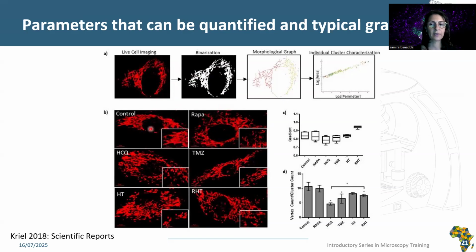And we can have the connectivity index here between the different clusters. In order to relate mitochondrial network dynamics to their topology, the connectivity between mitochondrial subunits was quantified in terms of the degree of scaling within the networks and the amount of overlap between membranes.